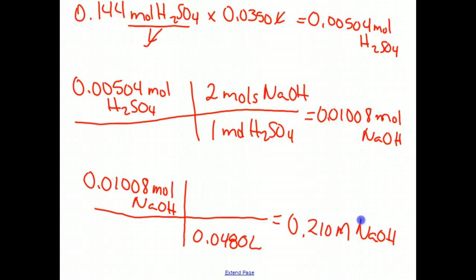Usually when we perform titrations, you'll typically use a pipette and a burette because the volumes that we use are going to be very precise, and this allows us to calculate each of the concentrations of our unknown solutions. So today in the virtual lab, you're going to calculate the unknown concentration of a particular item.